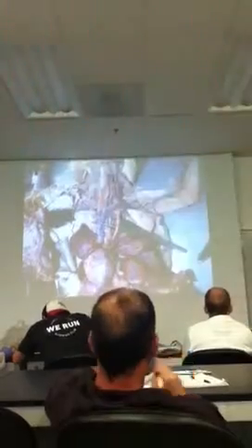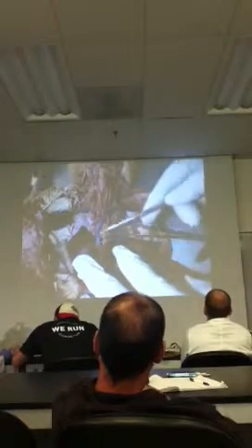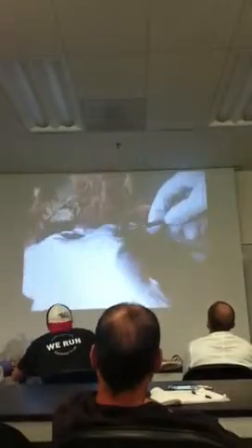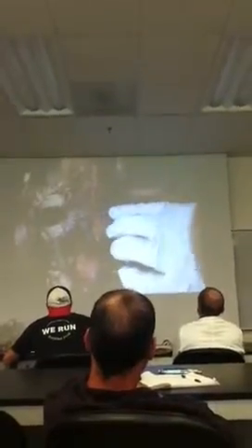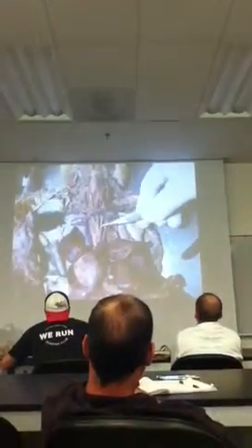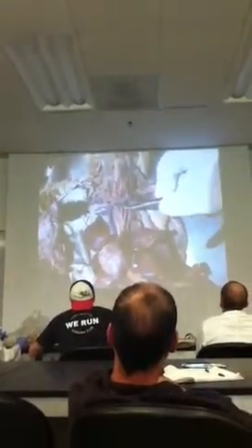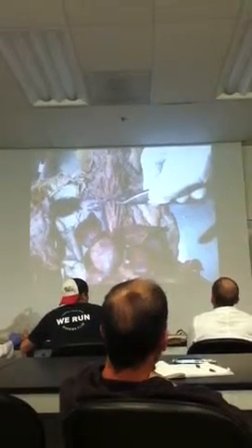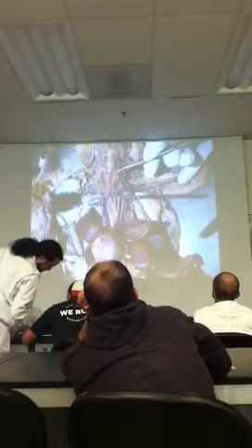Alright? Now let's continue with the brachiocephalic trunk here. It gives 3 branches in the cat. The first one goes toward the left side of the head and neck, it's the left common carotid artery, this one. As you follow that, you will see it goes toward the left side of the head and neck.